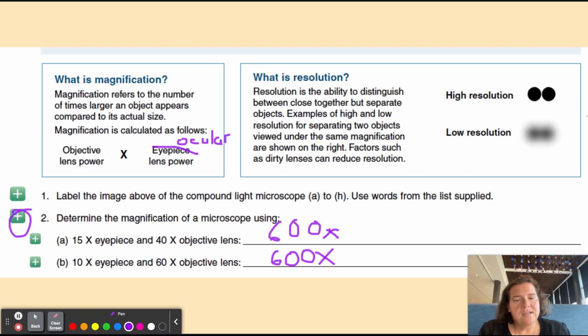And in one set of lenses, you see this fuzzy figure, and it's hard to tell that those are two distinct things. It's kind of like headlights in the distance might seem like they're just one light, but when they get closer to you, then you can see they're distinct and separate lights.